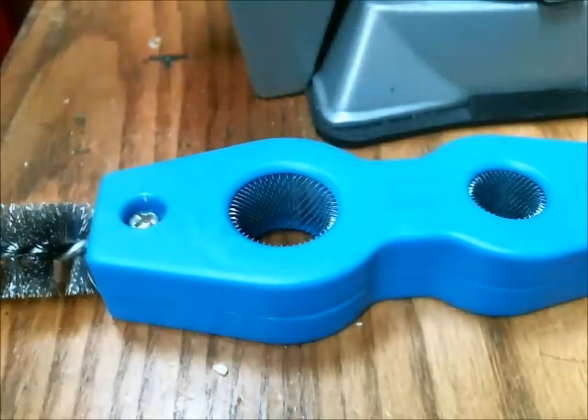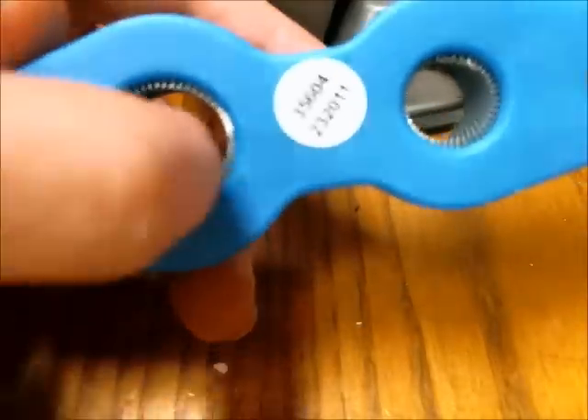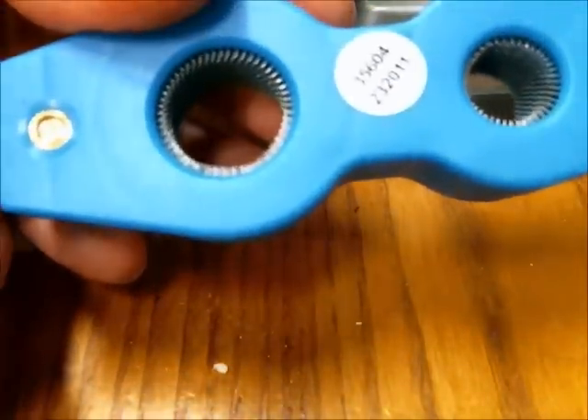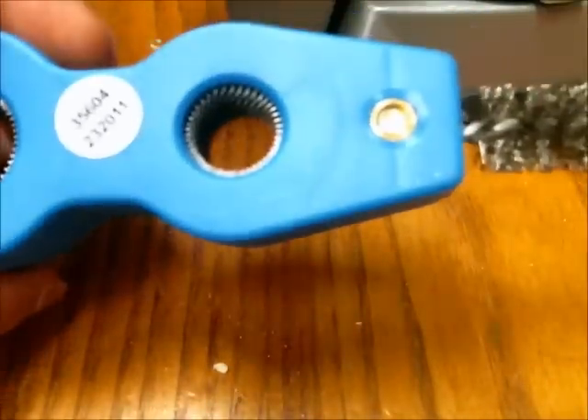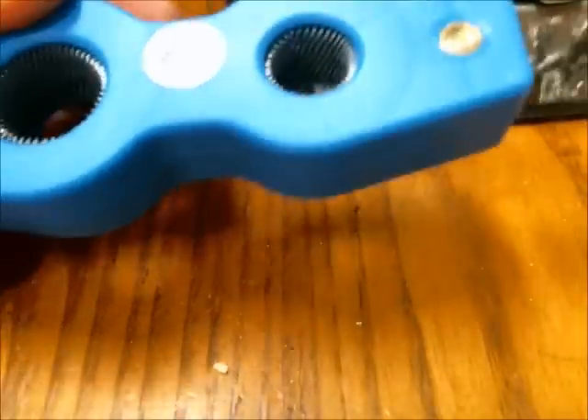This is the tool I use to clean the oxide off the copper. It's actually designed for cleaning car battery terminals. You just put the terminal inside the middle and rotate it to clean the corrosion off the battery terminal. It also worked quite well to remove the oxide from the copper rod I'm using.